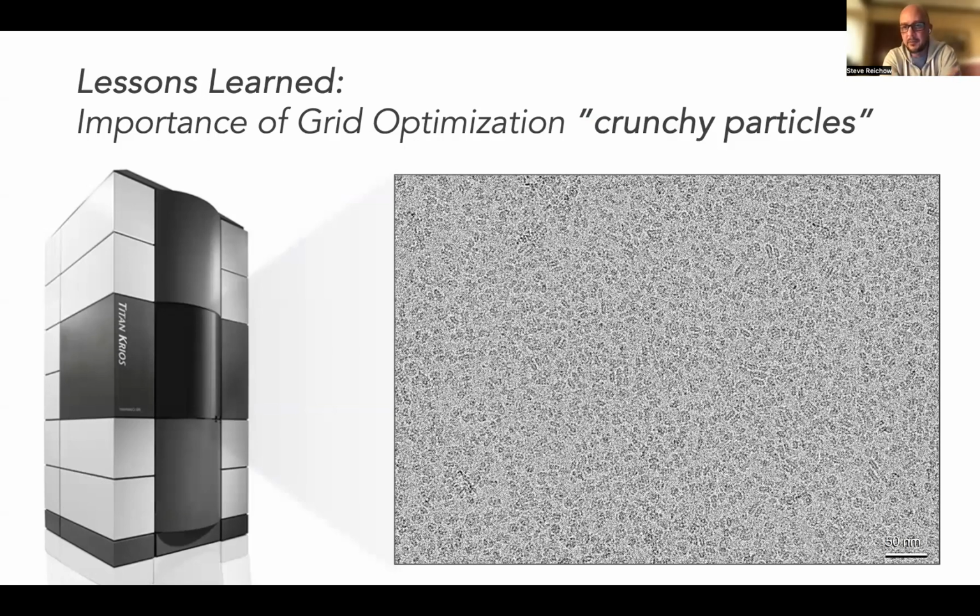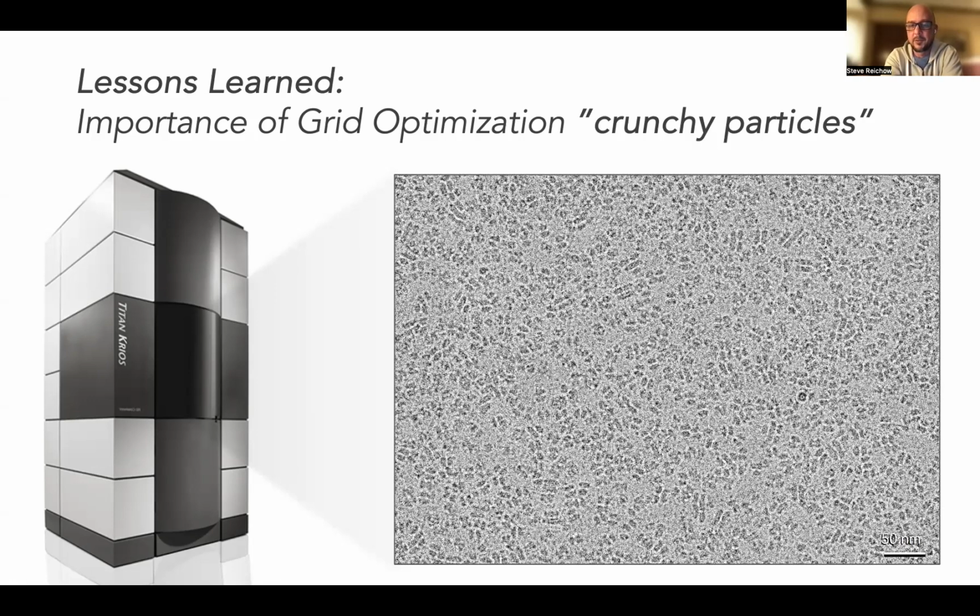So I'm showing you here an electron micrograph that we've collected on a very similar prep to what I've showed you before. But if you do a reconstruction on this data set, it'll only go to about 2.6 angstrom resolution. And that's because the ice thickness on this particular sample isn't as optimized as it could be. And so if we had worked harder to optimize the ice a little bit better, like in the micrograph shown here, this data set will easily go down to 2 angstroms and below.